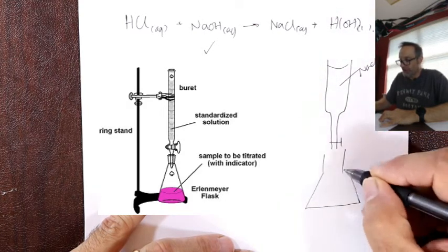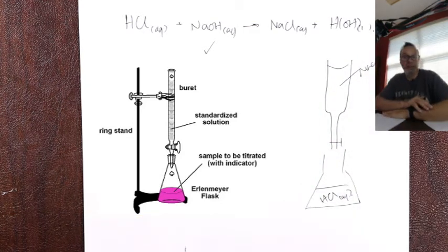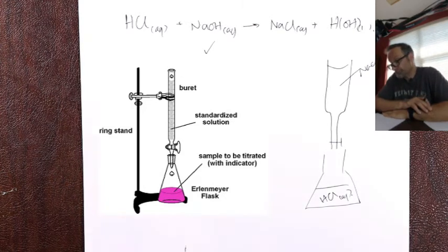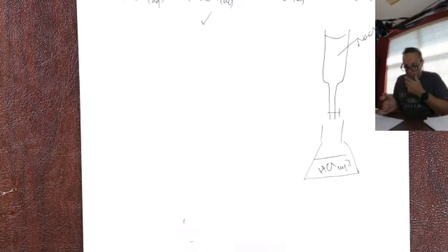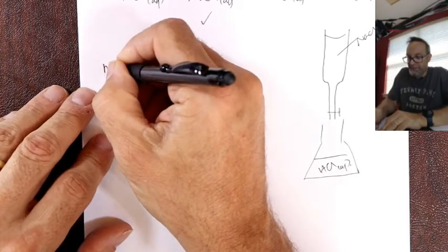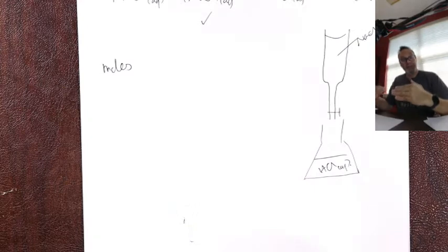But down here, we've got our test HCl solution. Now, I can't remember how many milliliters you use for that, but it's good to go. Now, here's the thing. At equivalence, one of these reacts with one of these. When they're exactly the same amount, it changes color.